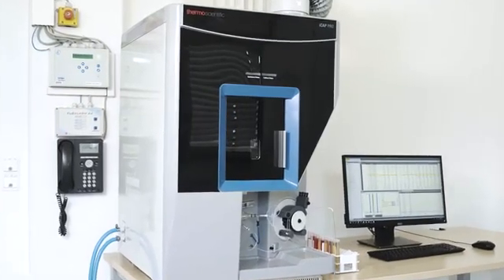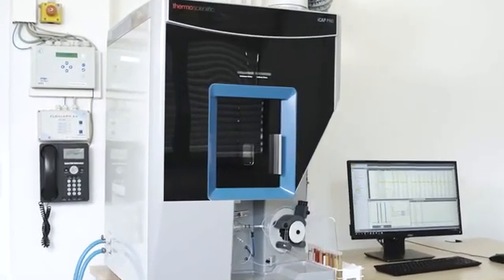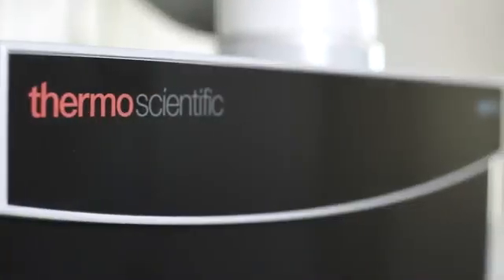Perform like a pro and win the race with robust high-speed trace elemental analysis.